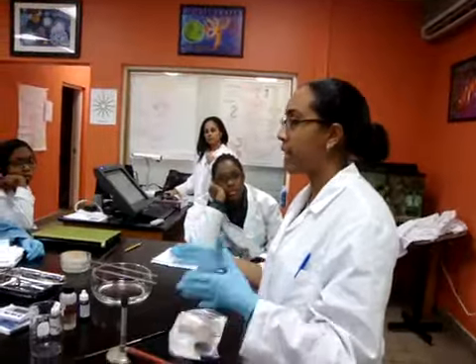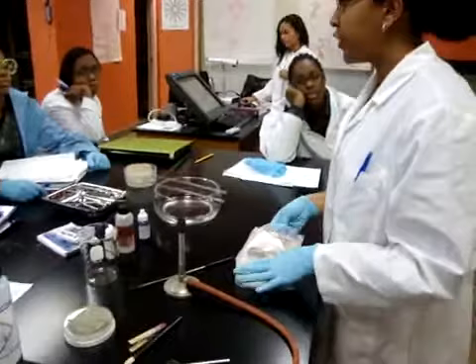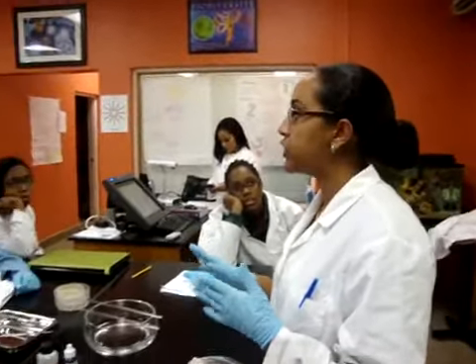Because you're going to be working with the bacteria with your hands, keep your hands away from your head. If you have to touch your face or anything, remove your gloves, wash your hands, do what you need to do, put your gloves back on, and continue with your experiment.